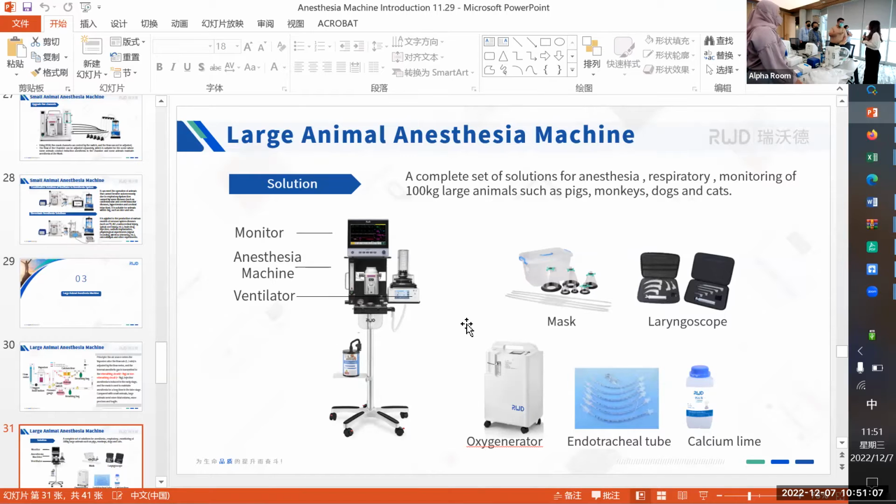Another question: just now you mentioned the CO2 regulator, right? If we want to euthanize the animal using CO2 because we want to avoid bleeding, can we use this machine? I mean, if we want to terminate the animal but using CO2 so that it doesn't bleed, can we use the CO2 regulator and put the animal inside the chamber? I think that can work. Yeah, just put the animal here.